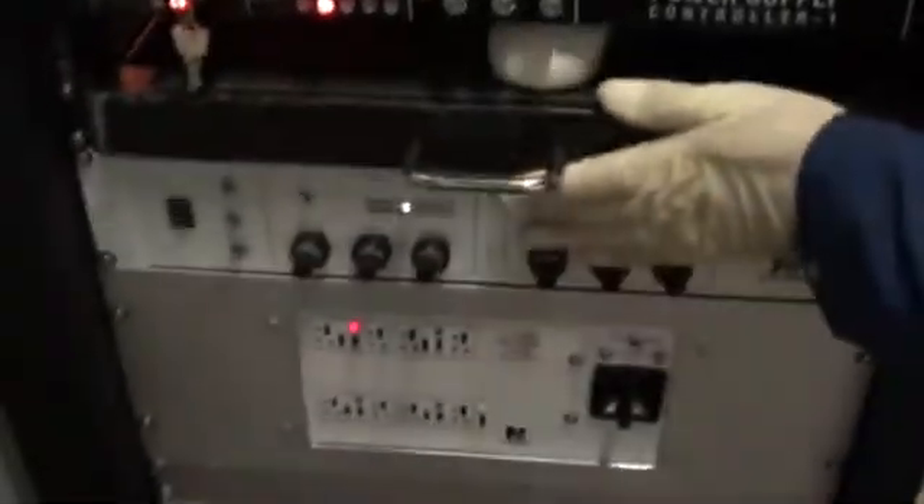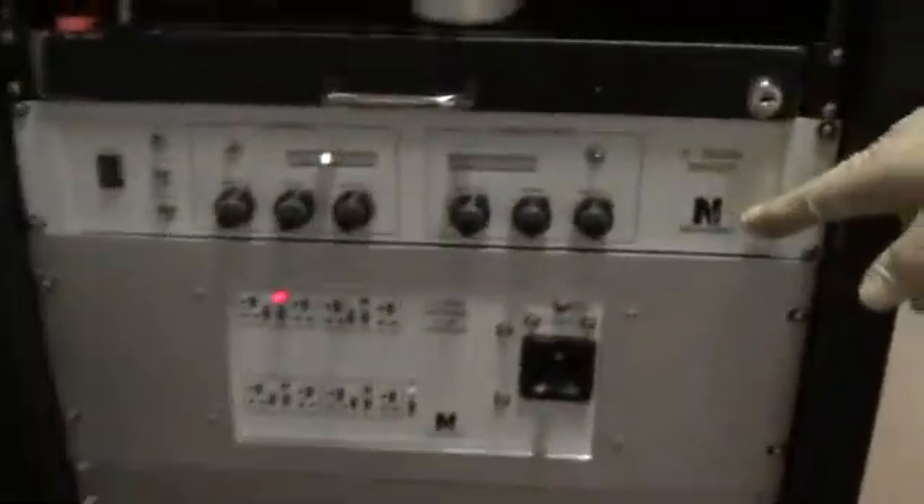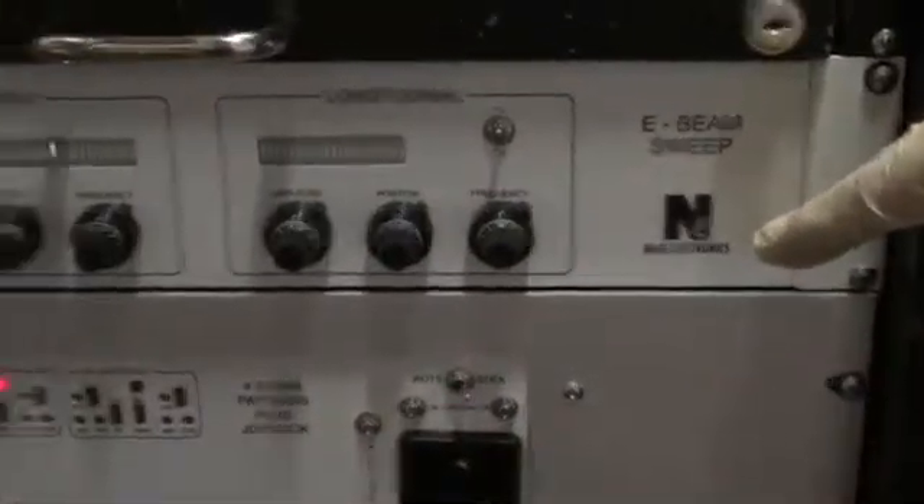This drawer here is our keyboard and mouse pad for the computer. This controller is our main sweep controller, and that is also a brand new controller — brand new Niles E-Beam sweep.